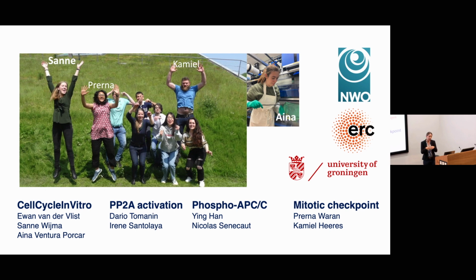They like to fuse a lot, and then obviously our measurements don't work so well. So we are really trying to go into a microfluidic system where all our droplets have the same size, and we are also much better able to control the size of the single droplet. But this is a quick and easy way, at least, to do it.